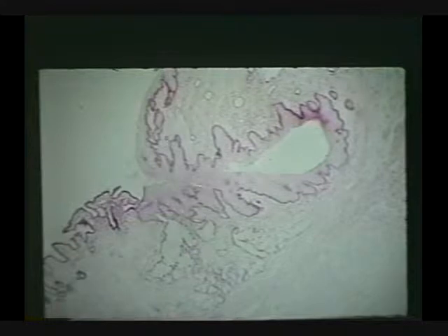Okay, identify the tissue. Non-keratinized stratified squamous. Identify the tissue. Simple columnar. Identify the structures. Mucus tubules. I mean, horrible slide. Okay, but there's enough clues that you can fill in all the blanks, can't you? Good job. Gastroesophageal junction.